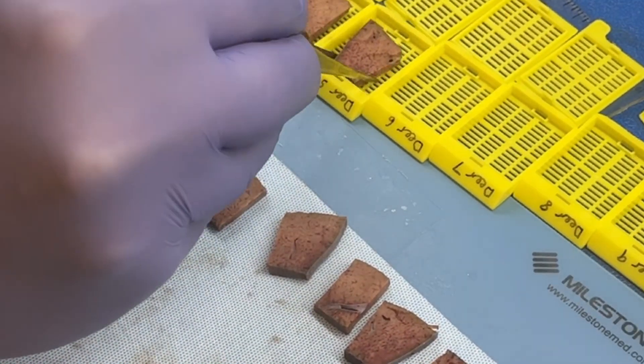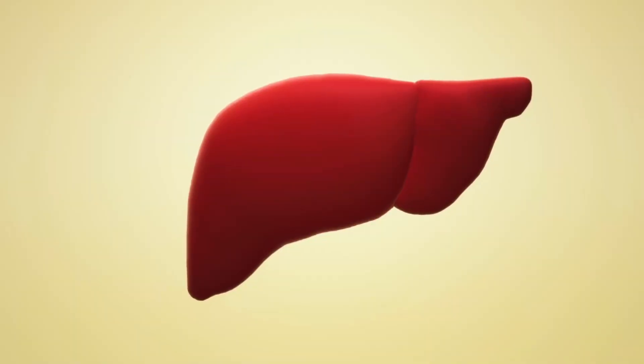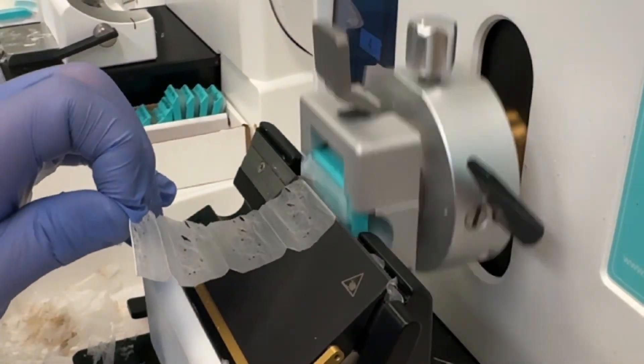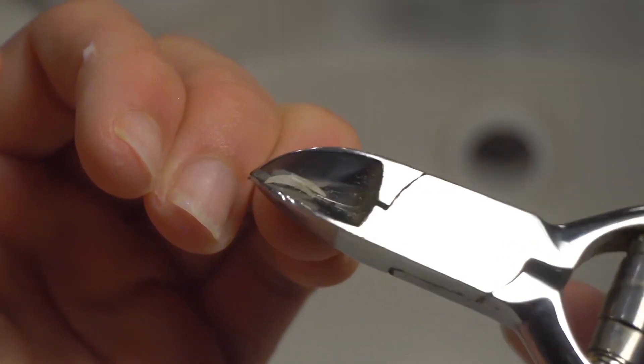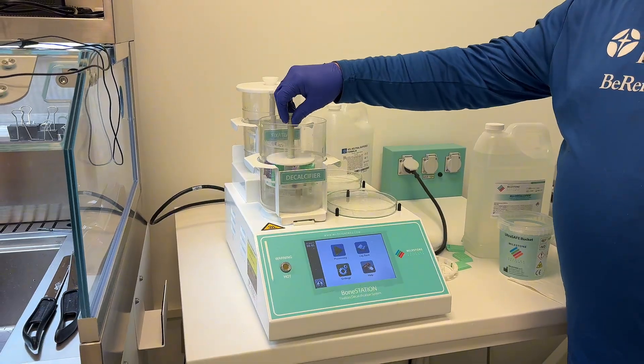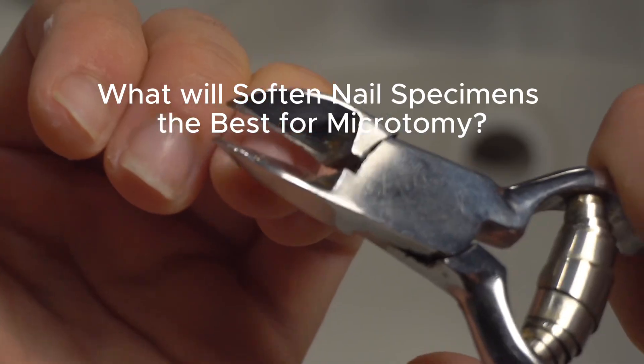Histology labs often deal with soft specimens that process and cut easily, like skin, liver, stomach, breast, and other soft tissues. But what happens when we get tougher specimens like bone or nails? To properly process and cut these harder samples, histotechs sometimes need to take extra steps to get a high quality slide for diagnosis.